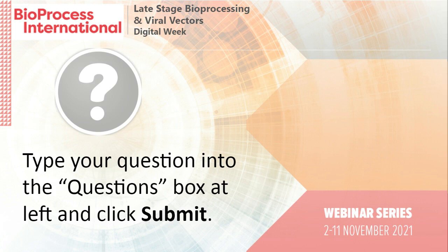That's an excellent question. For that, we would need to understand what a partially full AAV particle actually contains. If we imagine that the ddPCR assay targets a promoter or, in our case, GFP or CMV or poly A, whatever you're using as a target, you are going to be able to see only copy numbers that contain your target of interest. So if you, for example, have a truncated AAV genome and you use only a target which is in your promoter, then you're going to see all AAVs which contain that portion of your genome.